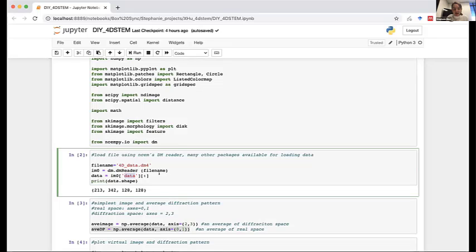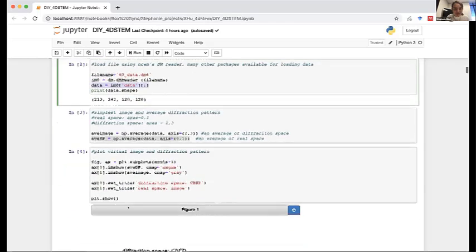And this is the line where I selected that I just wanted the data, but like you just said, Roberto, we could grab any part of the metadata, and that will be useful for plotting, having the calibration and other information that you may need to plot, like the scale bar, etc. Yeah, exactly.